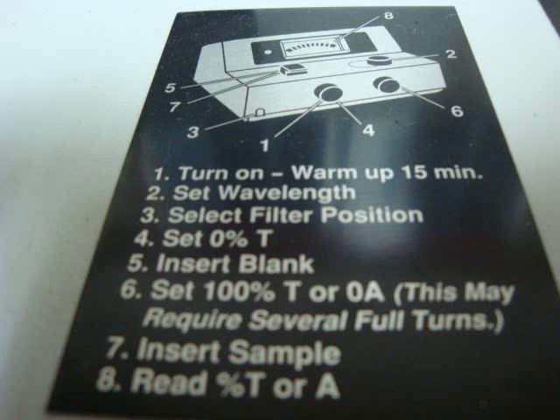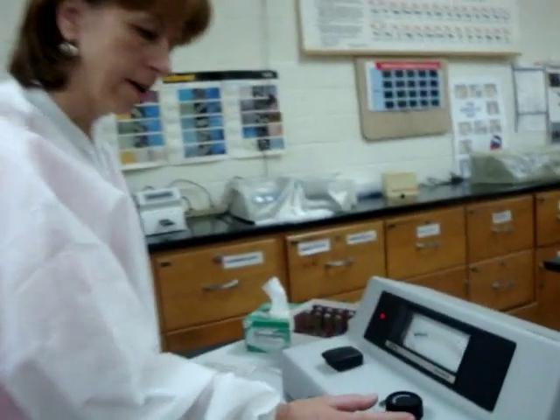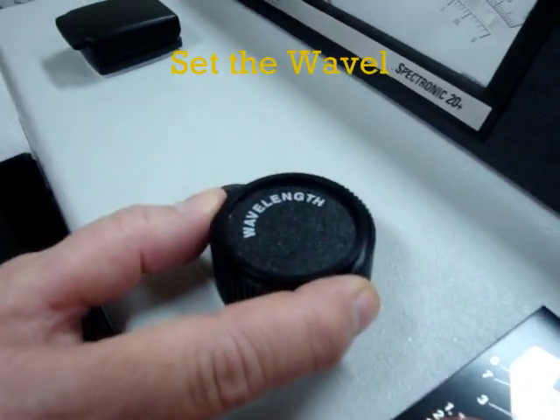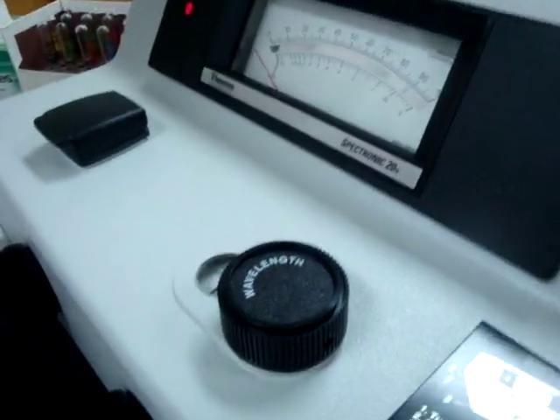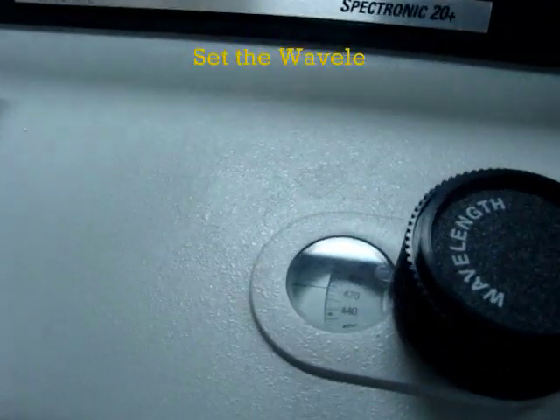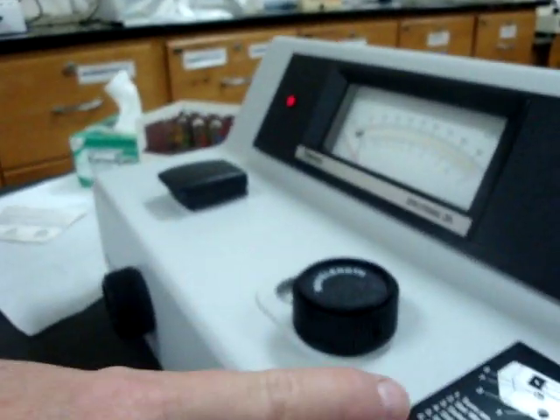For this one, warm up for 15 minutes, then set your wavelength. We'll set it to 420nm. Take this knob labeled 'wavelength' and turn it until it reaches the 420 mark. Sometimes you need to get almost right on top of it to see the 420 line. Adjust it until the pointer is exactly at 420.